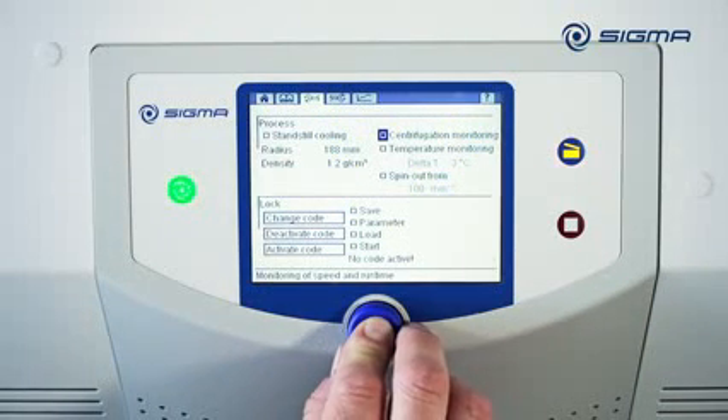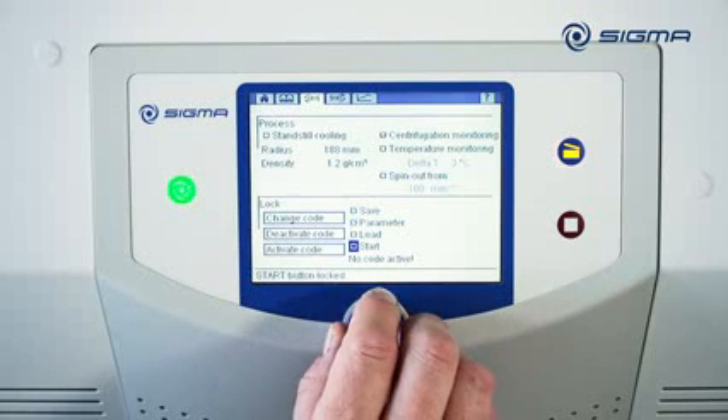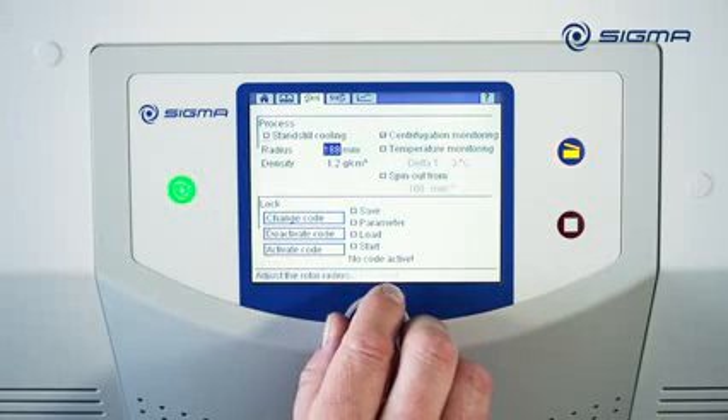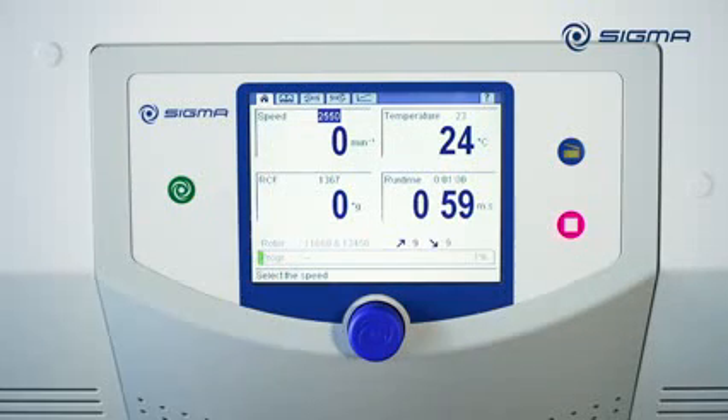If you enable the Centrifugation Monitoring option, the centrifugation run is continuously monitored and a message appears on the screen at the end of the process.